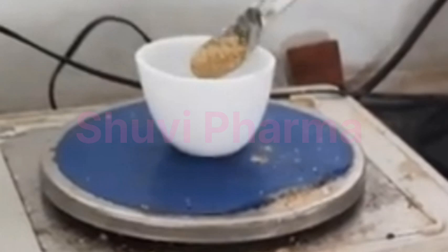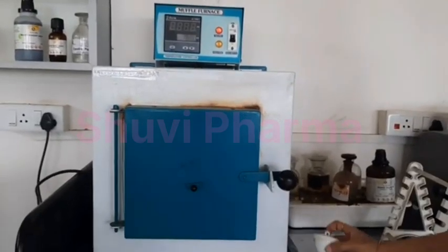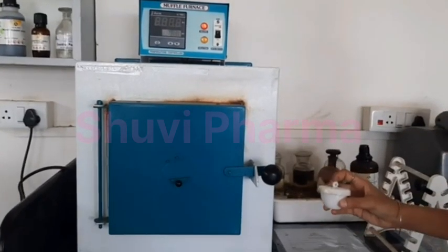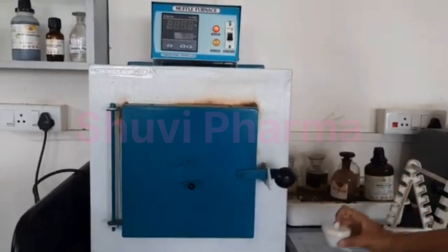To this empty crucible, we will add 2 grams of crude drug. So now we have weighed 2 grams of our drug in this crucible. This is the lid of the crucible.